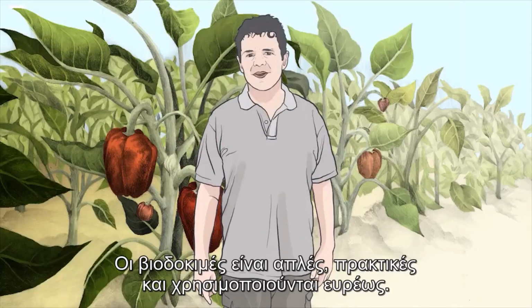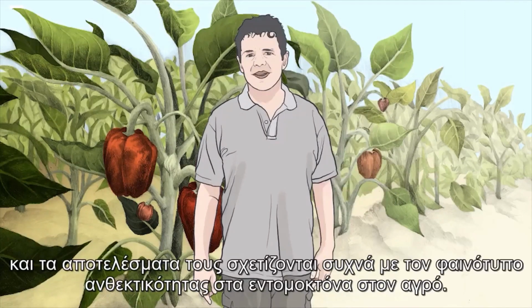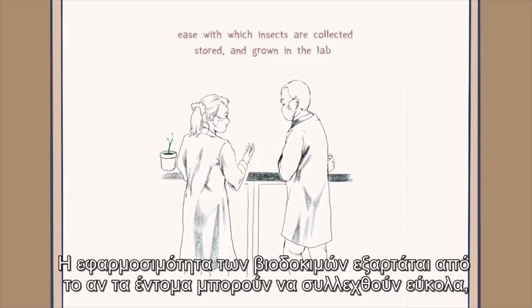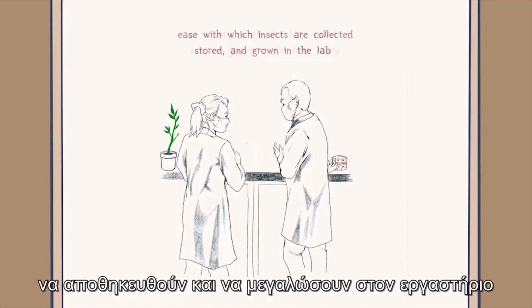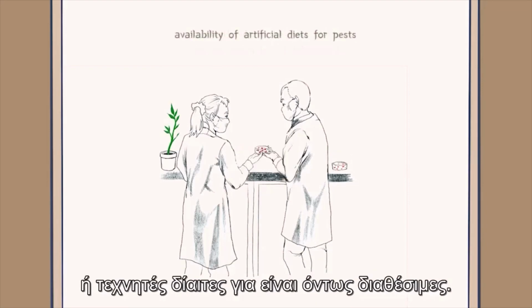Bioassays are simple, practical, and widely used. They don't require sophisticated equipment and expensive reagents, and the results are often directly relevant to the insecticide resistance phenotype in the field. The feasibility of bioassays depends on whether insects can be easily collected, stored, and grown in the lab, and equally, whether the host plant is easily cultivated in the lab or artificial diets for pests are available.